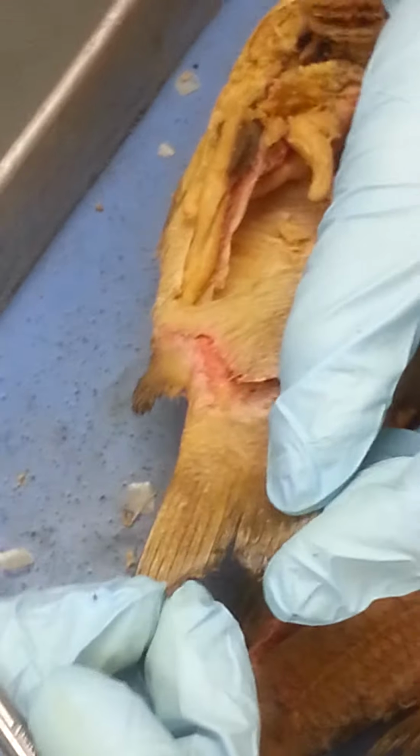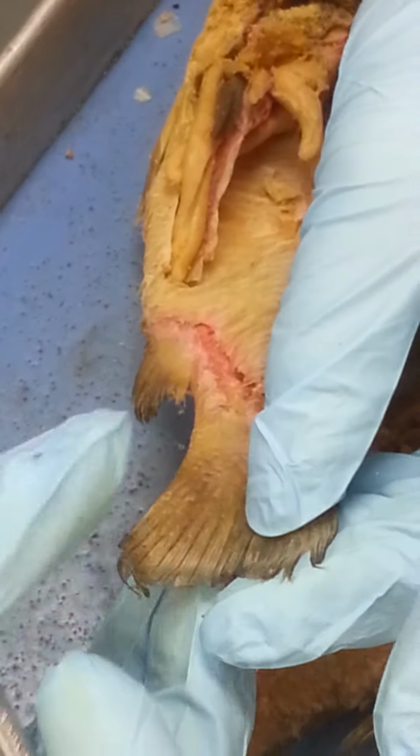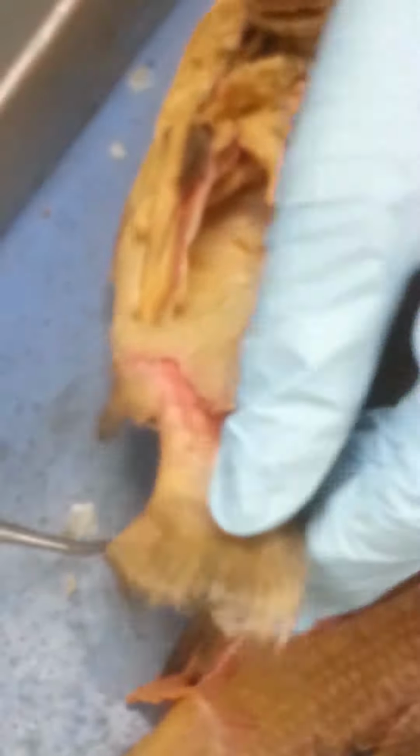Then this one is the caudal fin, and what type of fin is this? Homocercal. Yeah. So you can fold it over, and it's completely symmetrical. Okay. Then you have your anal fin, your pelvic fin, and your pectoral fin. Okay, and that one's paired as well.